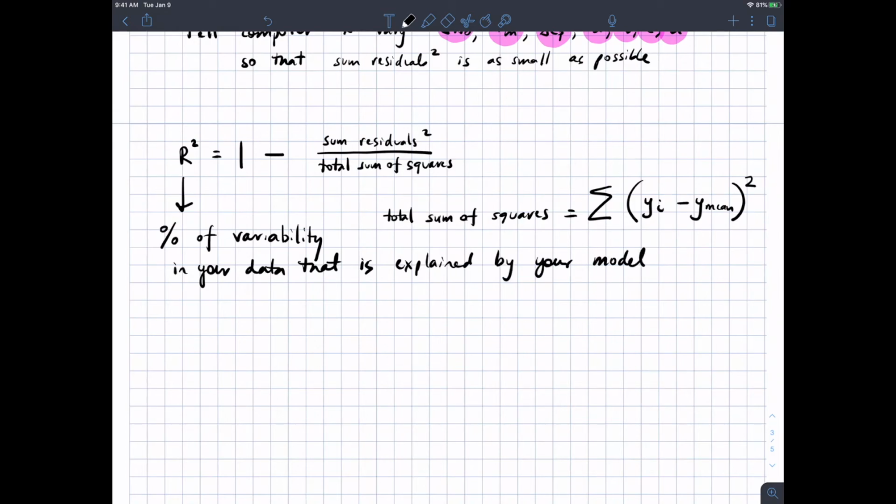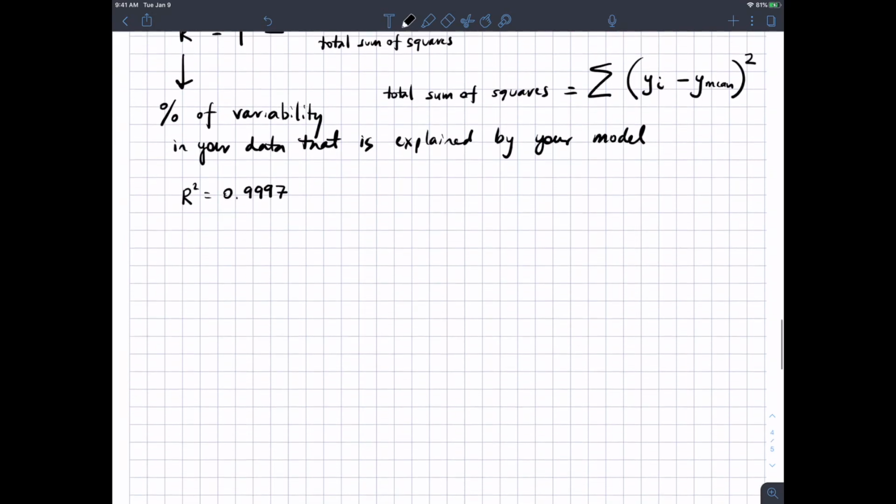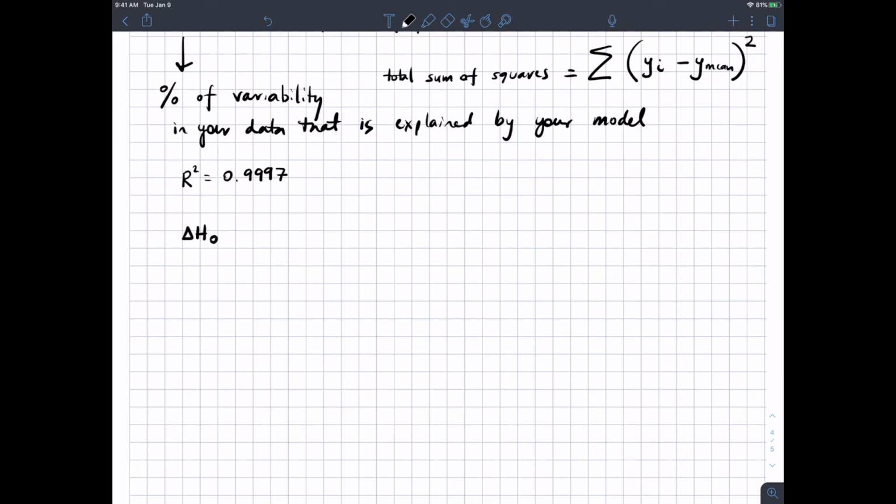In this case, our two-state model of folding. And so in general, our high-quality fits generally have r squareds in the sort of 0.9997 range. The output of the fit is going to give you some parameter value plus or minus a calculated standard error.